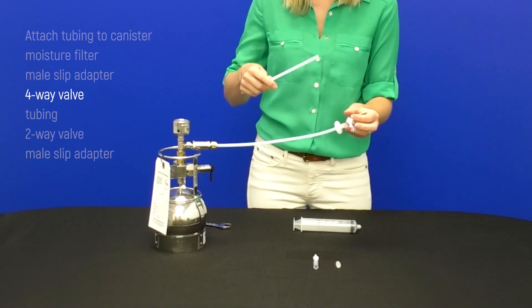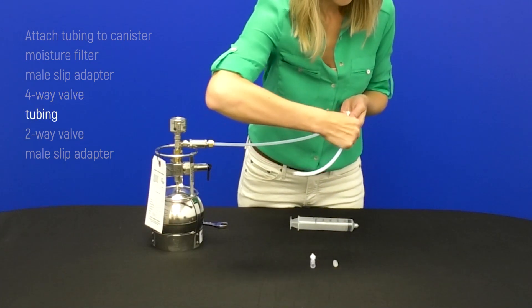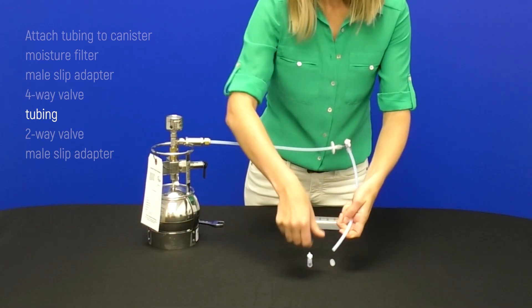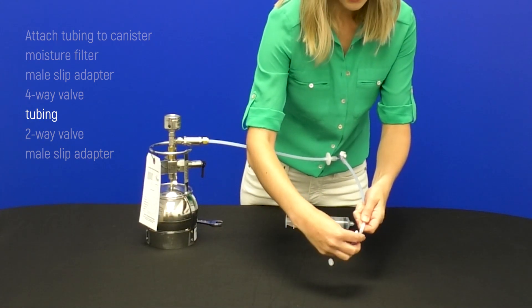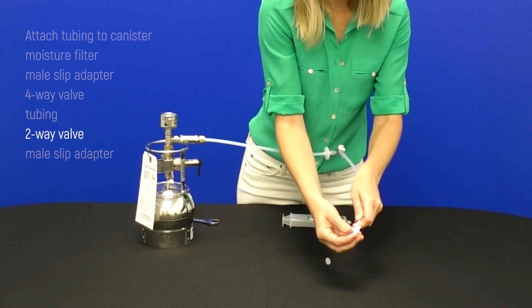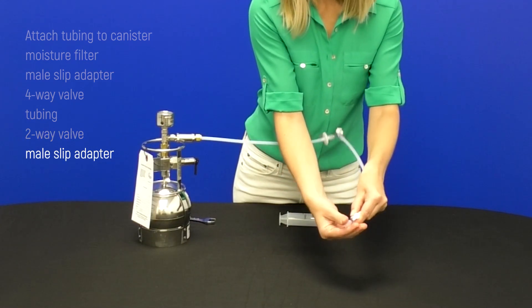And from there, you can attach a piece of tubing down to your sampling point. And then the two-way valve at the bottom and the male slip adapter to connect down to your sampling point.